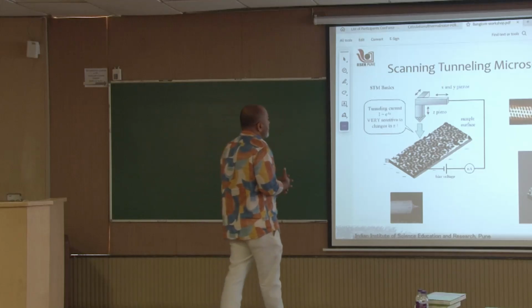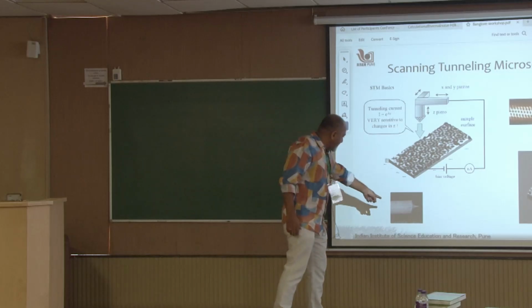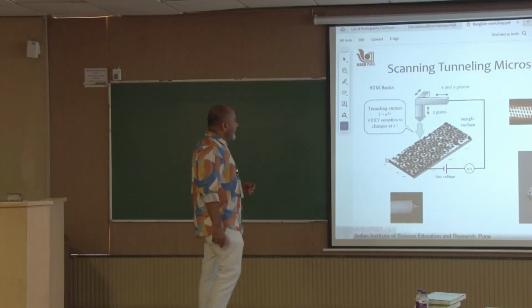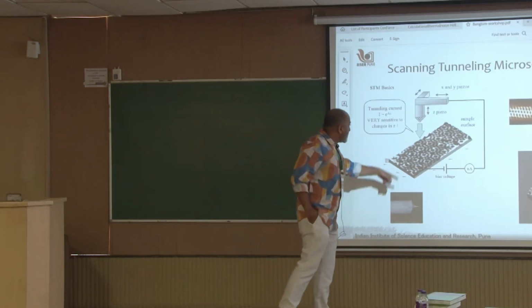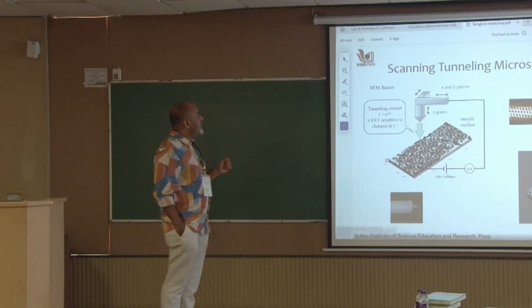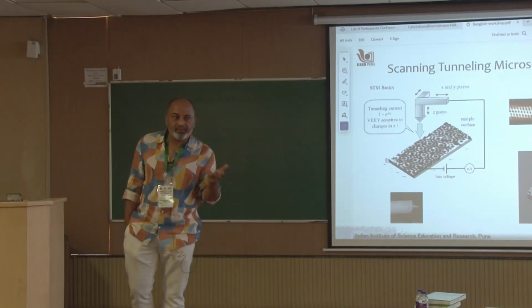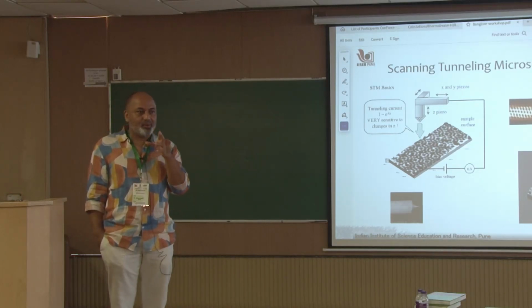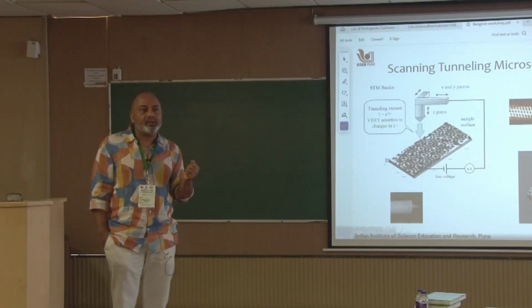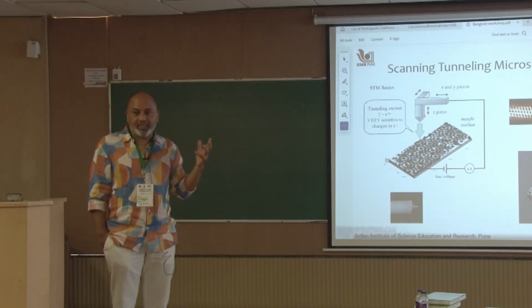So this is an extremely sharp, atomically sharp tip, and there are ways to make this. This is a tungsten tip that we have made in our lab, and this kind of tip is mounted on a tripod design, which is basically X, Y, and Z piezo stacks. You know what piezoelectricity is, right? Everyone knows, or to some extent. Piezoelectricity is when you apply a voltage and it expands; you apply like 10 volts or 100 volts and it expands by an angstrom or two. So it's extremely precise in terms of movement.